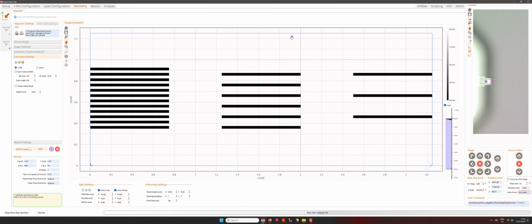Hi everyone, so in this video we will see quite an advanced topic. We saw together how to pattern on insulating substrates with pulse heating and with temperature maps. If we want to pattern also in grayscale, that's an option. We also have videos regarding high resolution patterning strategies and high resolution patterning on high resolution stack that you can watch, and I recommend you to watch before watching this video.